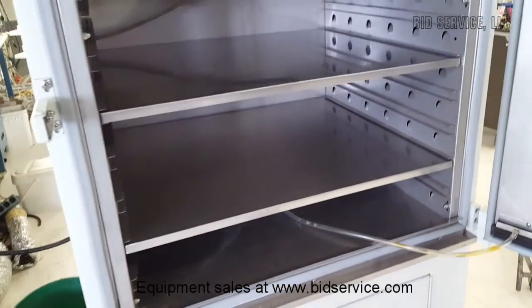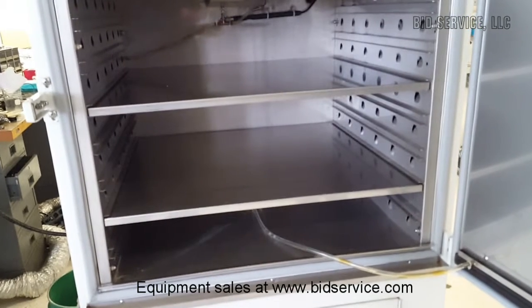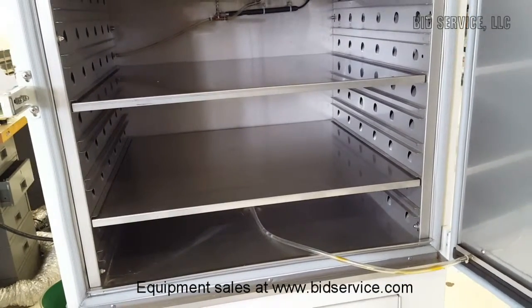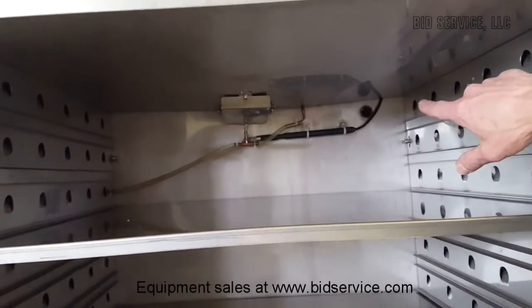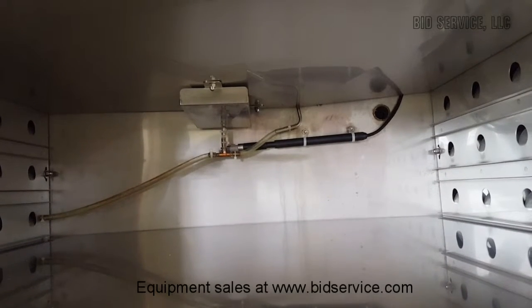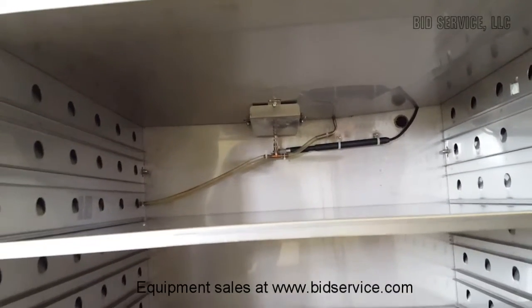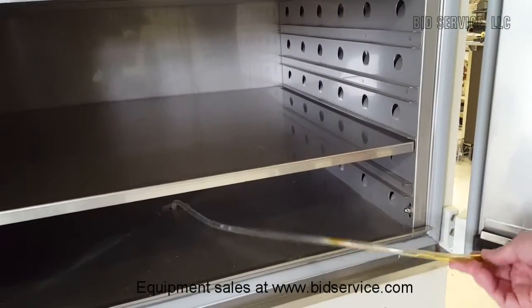We'll go inside the chamber. The blower's on and it's blowing from right to left. You have two shelves. And I think that's where you have your humidity sensors that are on the back wall.